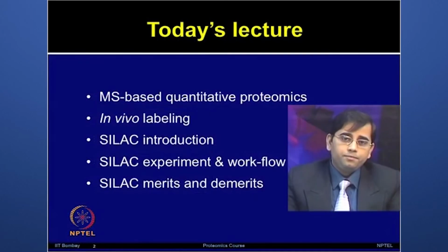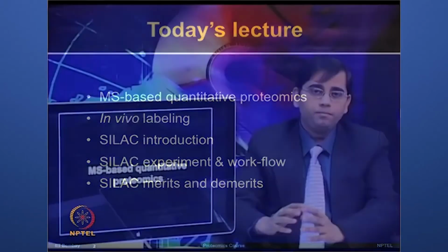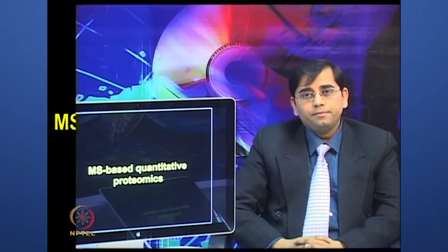So, in today's lecture, we will first discuss MS based quantitative proteomics, in vivo labeling methods. I will introduce SILAC, and then we will talk about the SILAC experiment and the step by step workflow. We will then discuss the merits and demerits of the SILAC method. So, let us start with MS based quantitative proteomics.